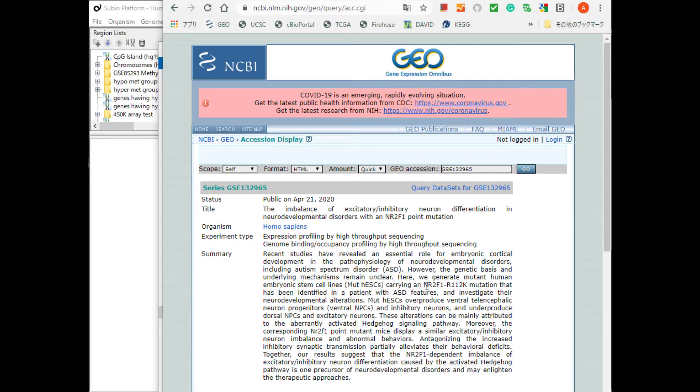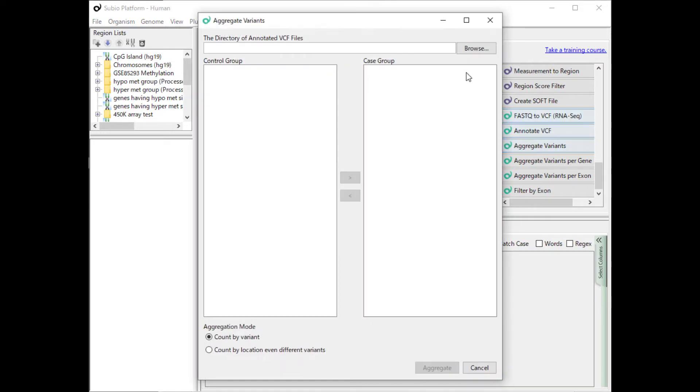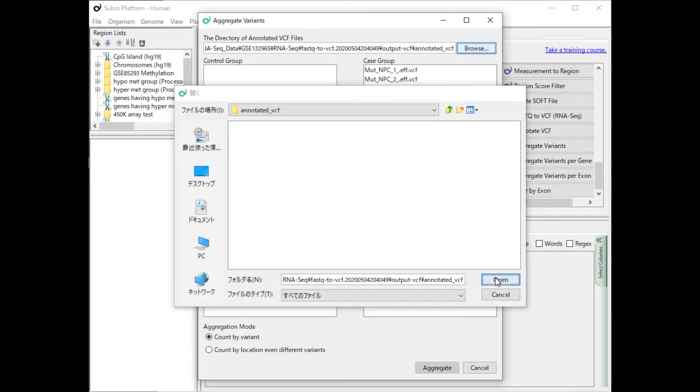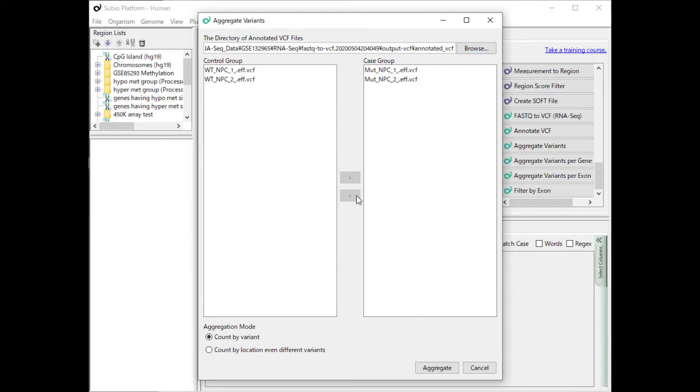An amino acid substitution of R112K occurs in the mutant NR2F1. Open the Aggregate Variants tool and use the Annotate VCF tool to specify the location where the annotated VCF file is stored.